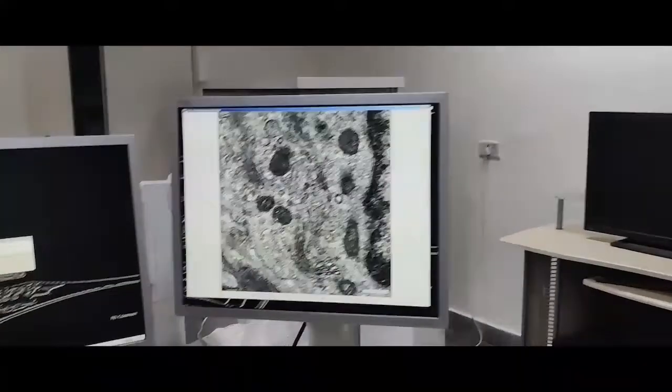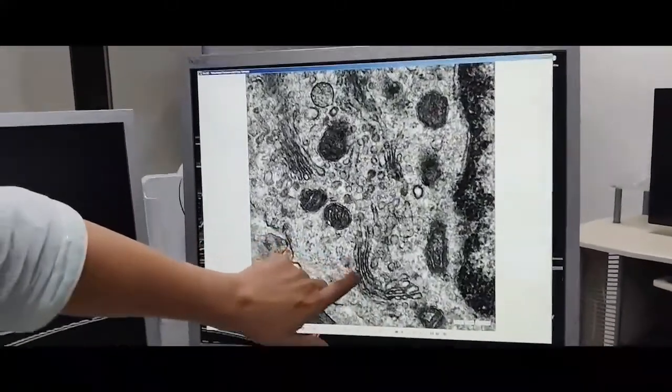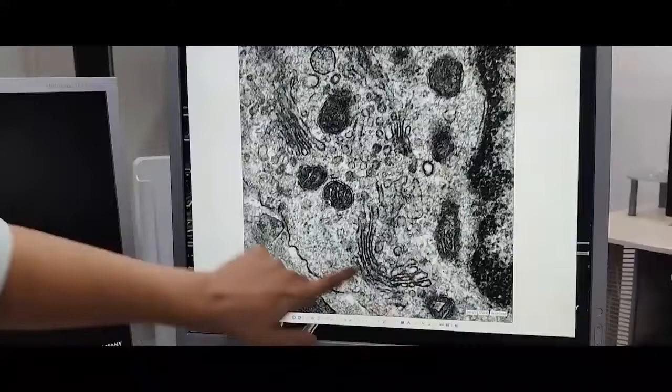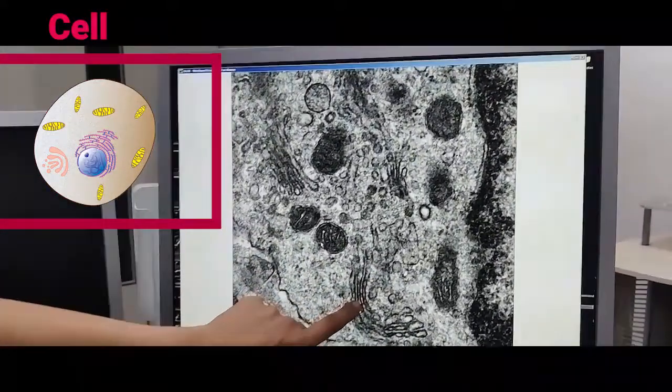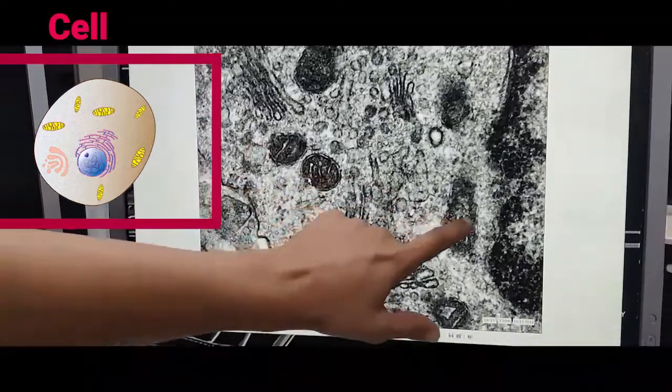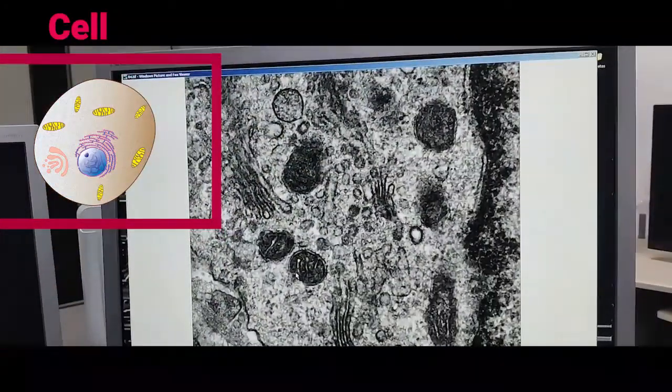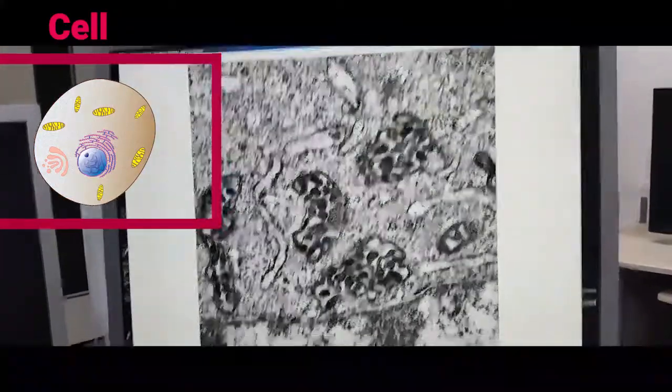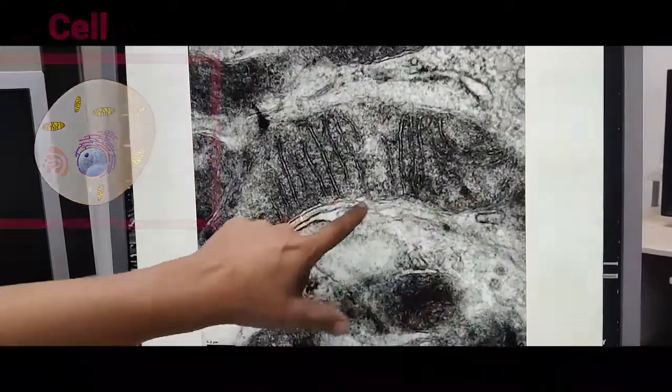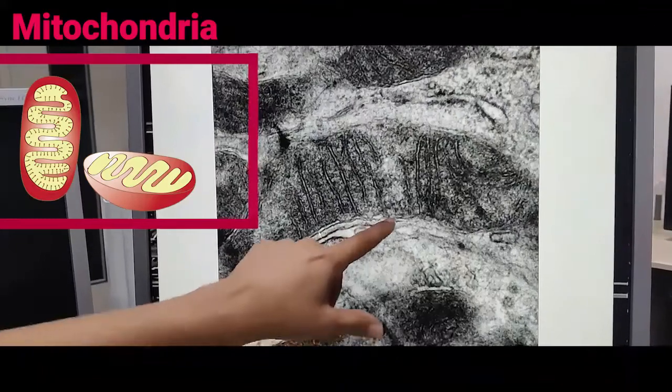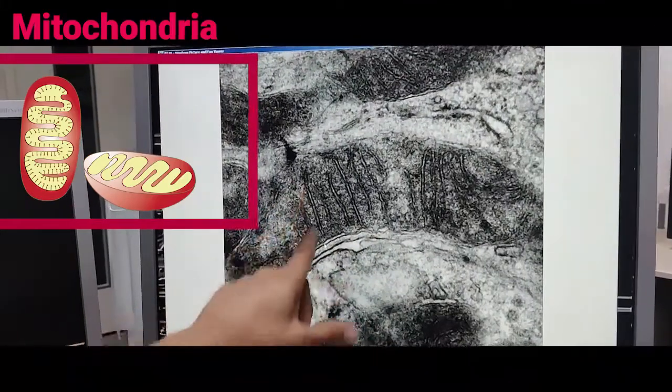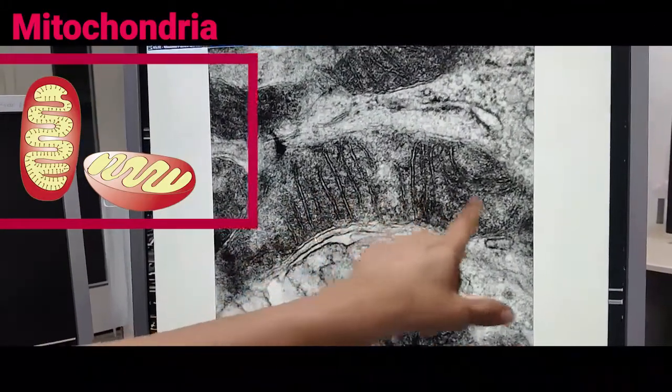You see this image, what you see here is a typical Golgi apparatus. You can see the cisternae stacked and these small things are the mitochondria. Let me just show you some more pictures. This one. So, this is a typical mitochondria that you can see. You have the outer membrane, you have the inner membrane and now these are the cristae of the mitochondria.